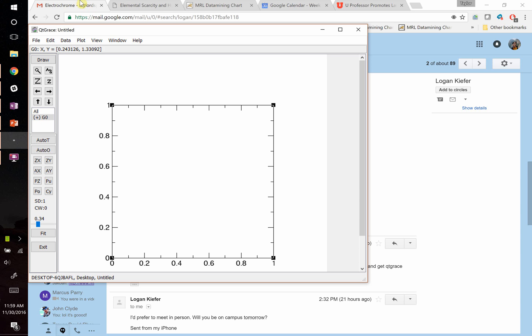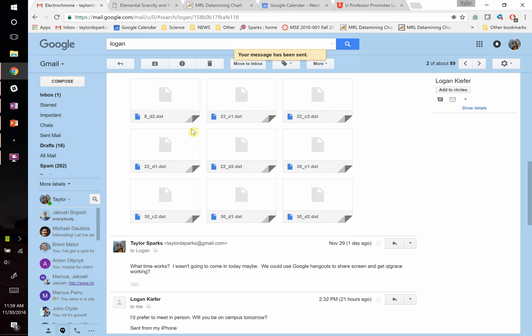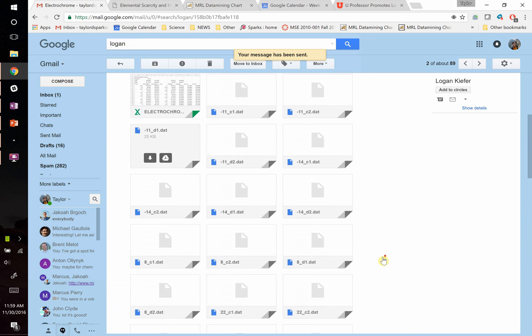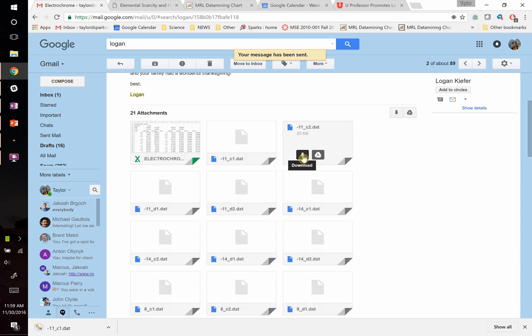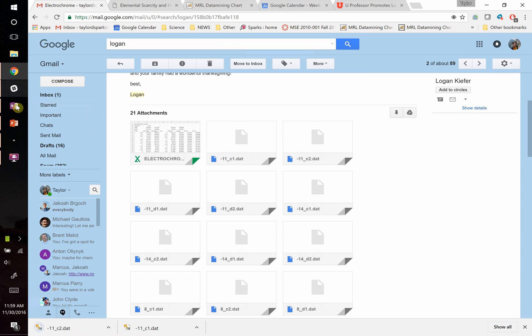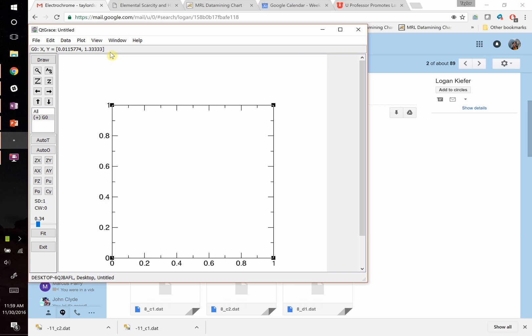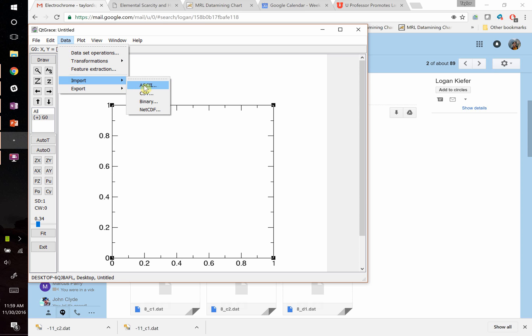So to do it, you have to grab your data first. Let's grab a data set like this negative 11 C1 and negative 1 C2. Those are both .dat files, so we can import those. You go to Data, go to Import, ASCII.